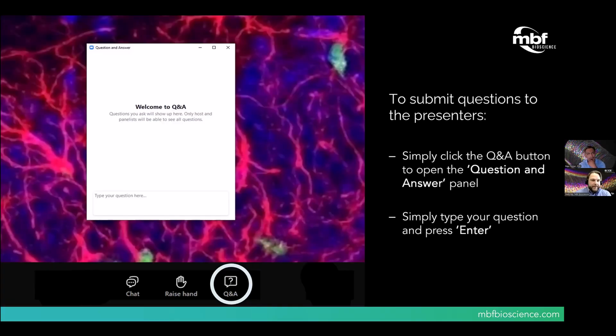See another question here about taking 3D images of other tissues like the spleen. Yes, you can definitely use the slice for many different types of tissues. If you're able to clear it, that typically helps if you want to image the full volume. But really any organ up to 20 by 20 by 18 millimeters is the scan range we can achieve on the slice. See another question here about the Z points for the RI compensation.